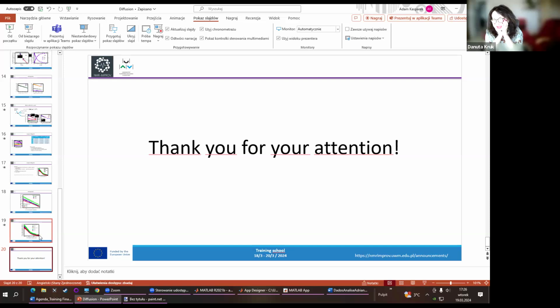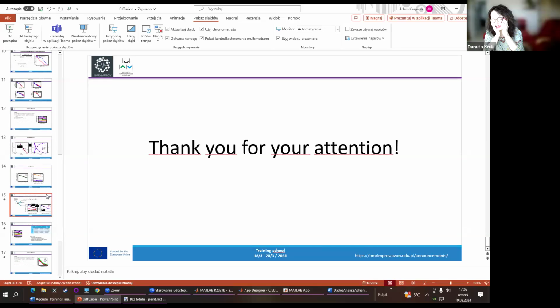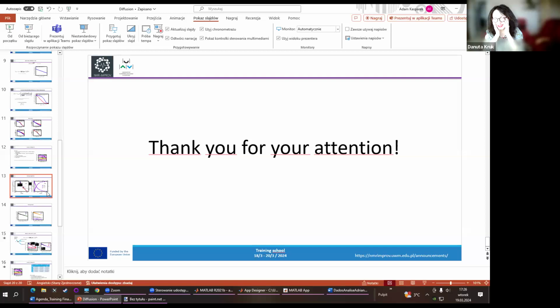I fear that now you are of the opinion that it is extremely difficult to analyze NMR relaxation data, and it's not because of Adam's lecture. This is not what I wanted to say. But really, after my lecture and Adam's lecture, we figured out that the crucial thing is to find the proper model, and it is really not clear what the model stems from and how to choose the proper model. But do not worry, we'll continue.